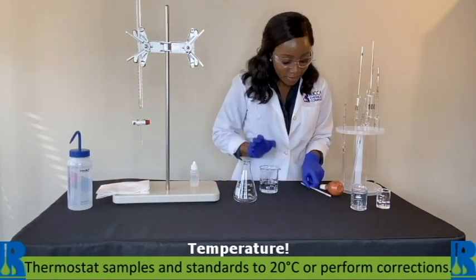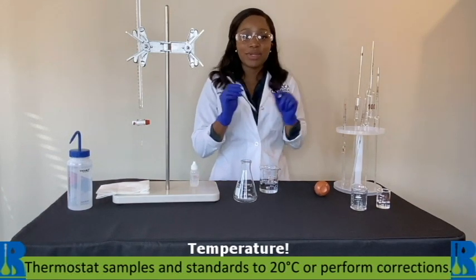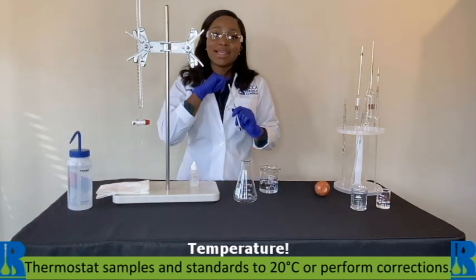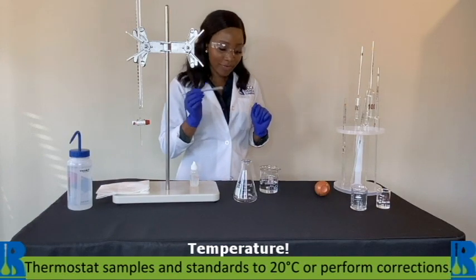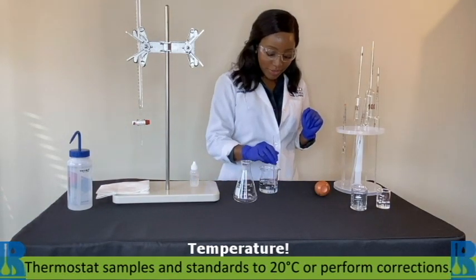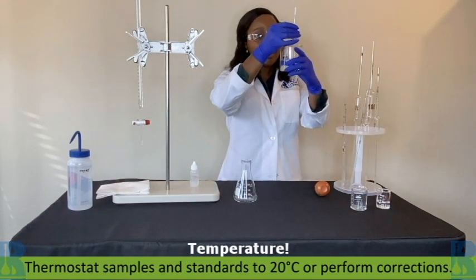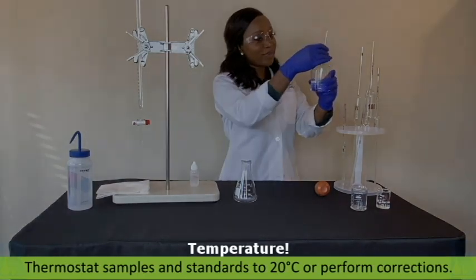For our sample, first things first, you need to make sure that the temperature is either at 20 degrees based on NIST traceability, or you'll do temperature corrections. Everything is calibrated. Everything is traceable. Go ahead and take that temperature — and we are at 20 degrees.